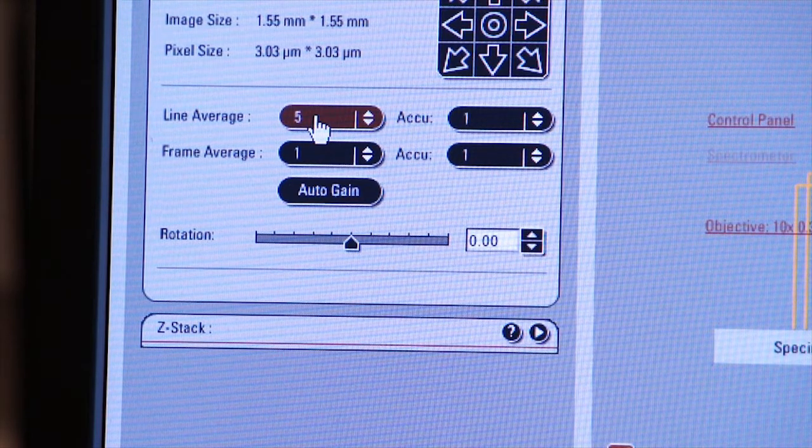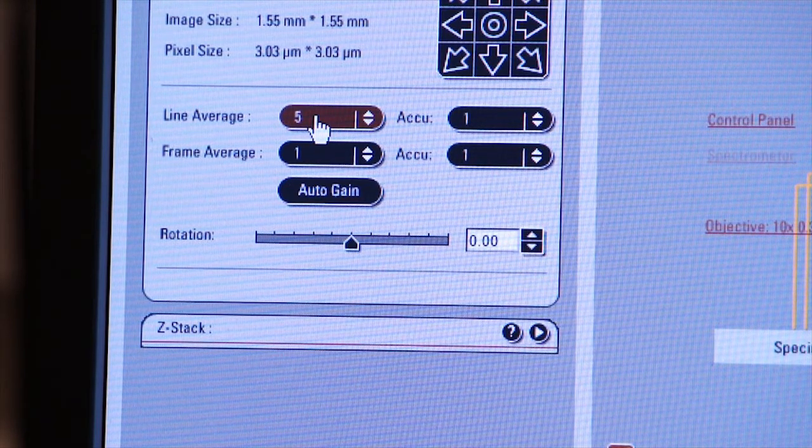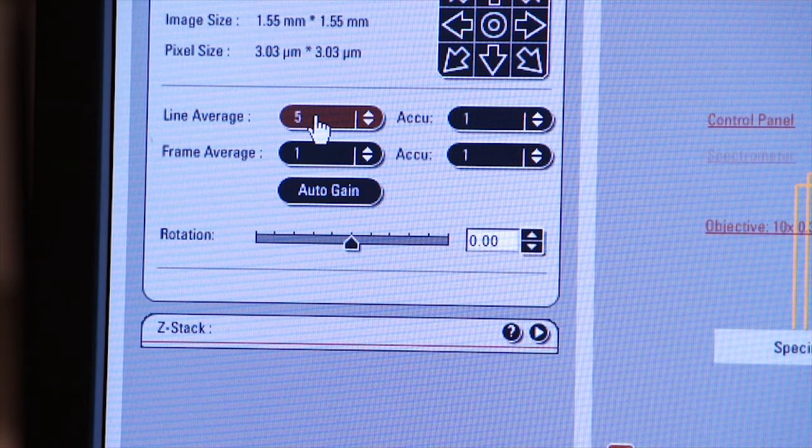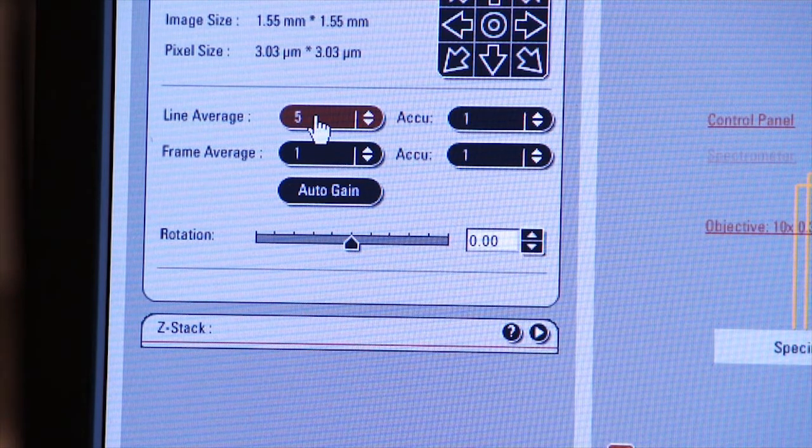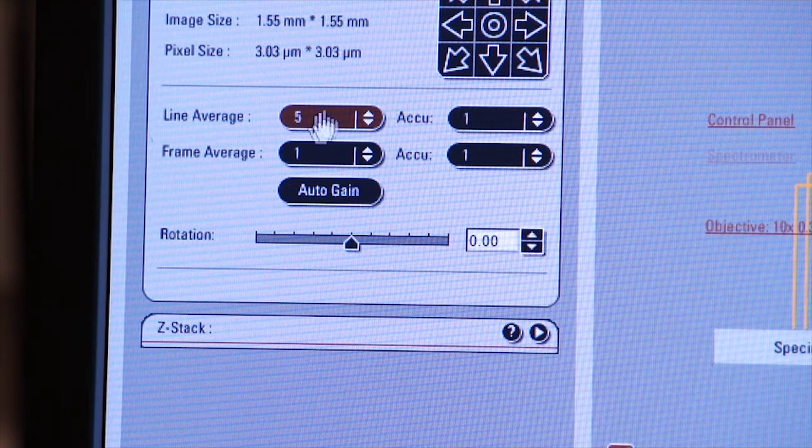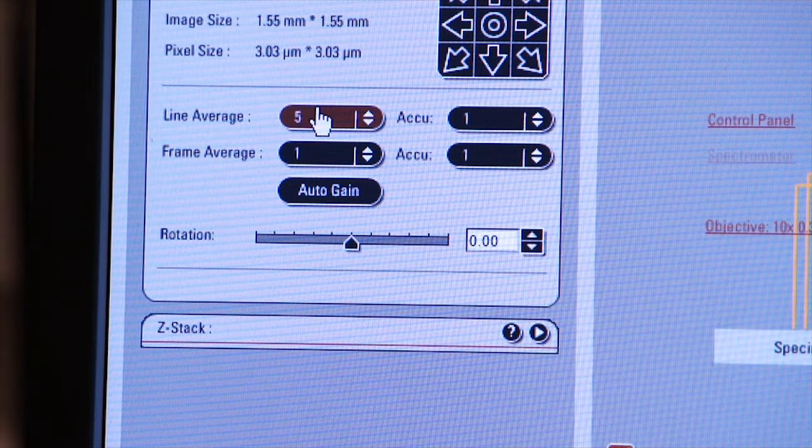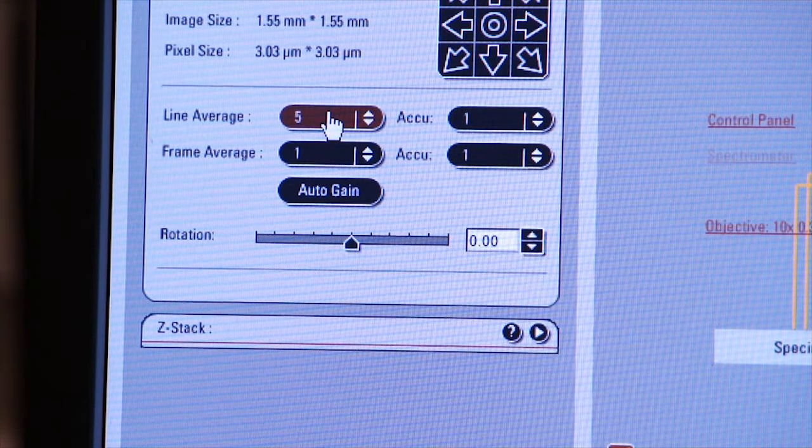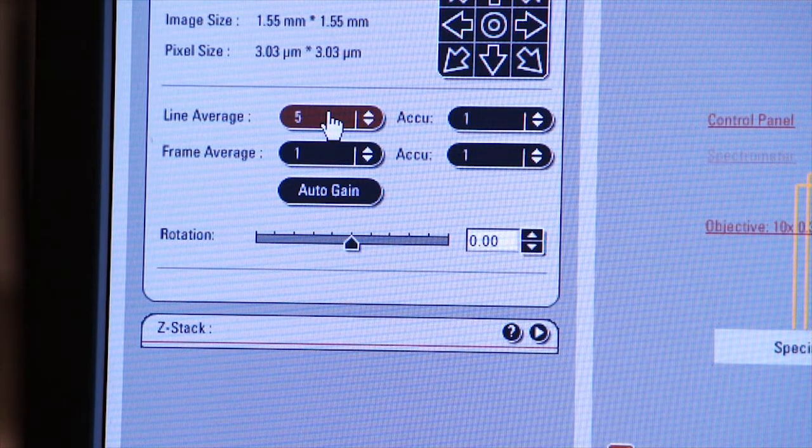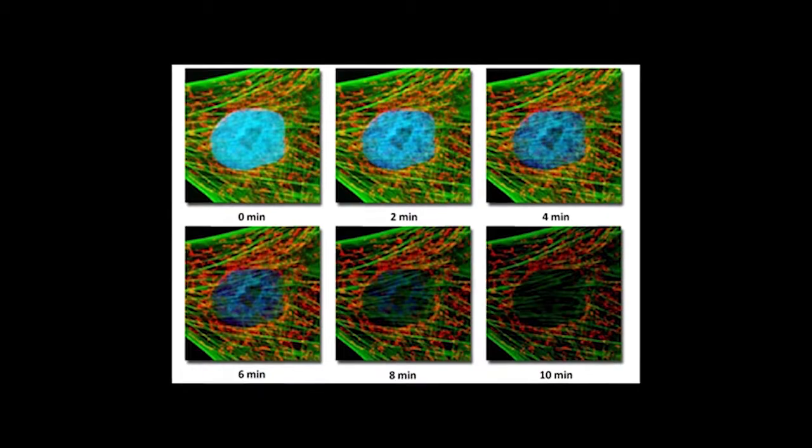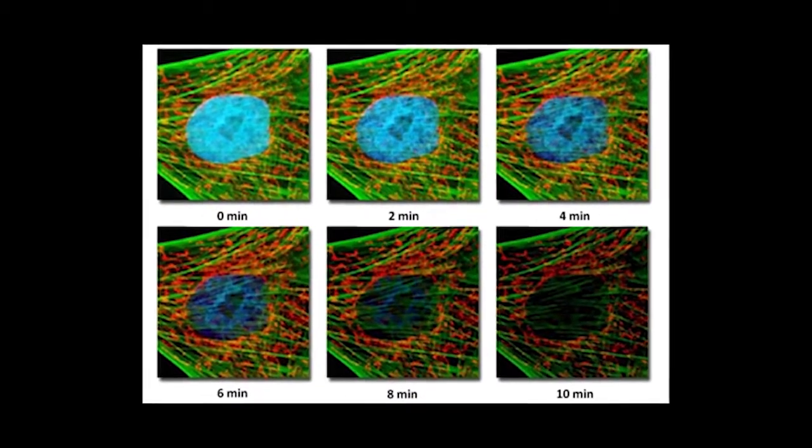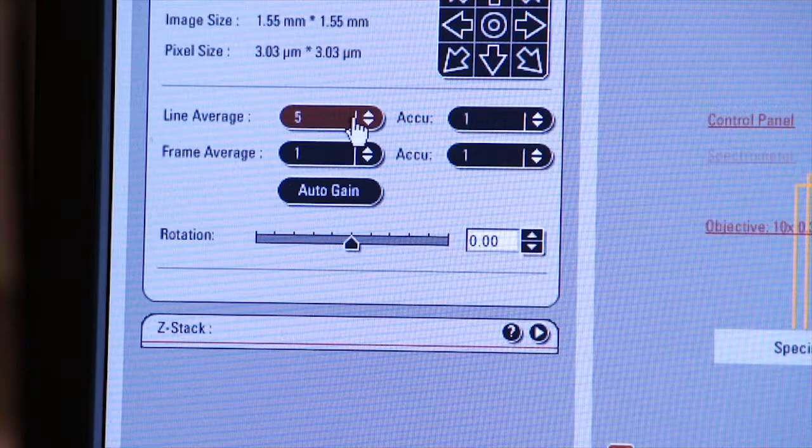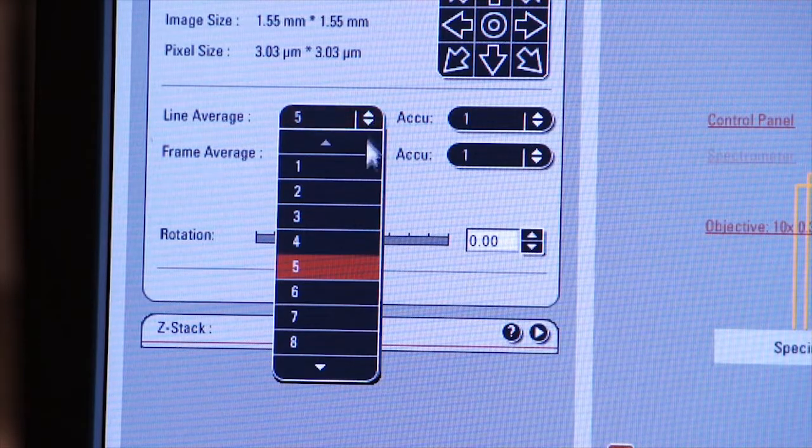My fluorophore may be photo bleached more because the laser is hitting it with more light, and so it's a trade-off. You want to get the crispest, cleanest image that you can using line averaging, but remember that you run the risk of photo bleaching your specimen. For now, we'll leave it at one.